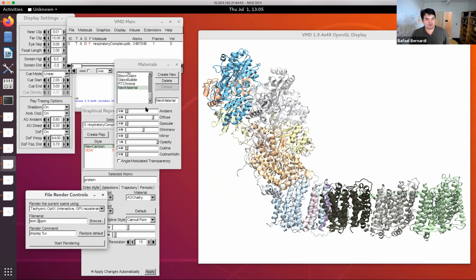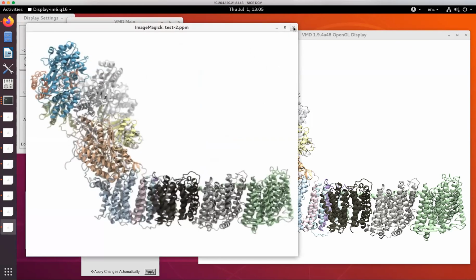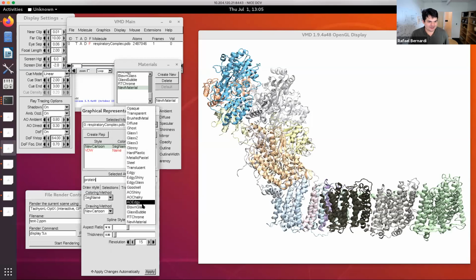But okay, I change and create a new material here. There are a few things that I like. One of them is the outline. I really like to see the protein better. So if I render just quickly here, you're going to see it. I forgot to change it. You didn't change it yet. Yeah, you have to use it. I can come here and change from AO Chalky to the new material.